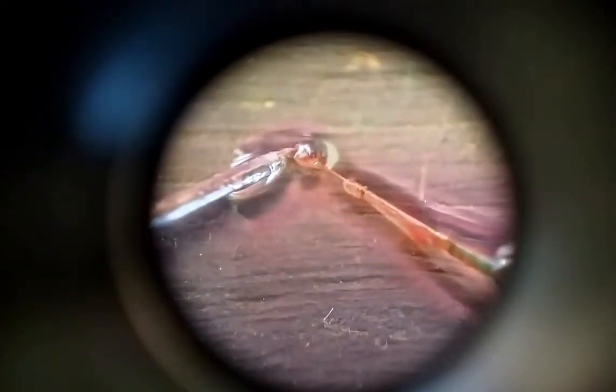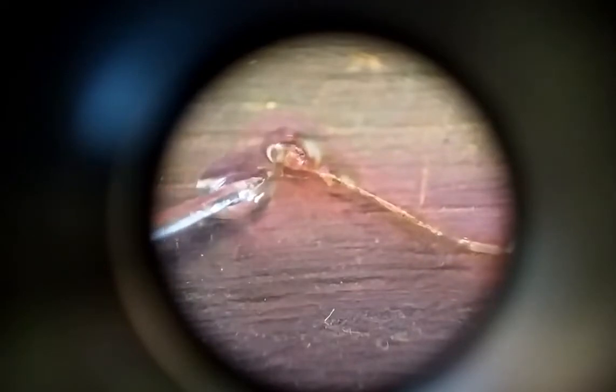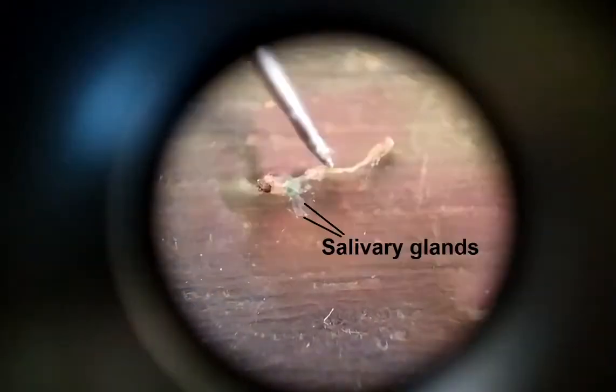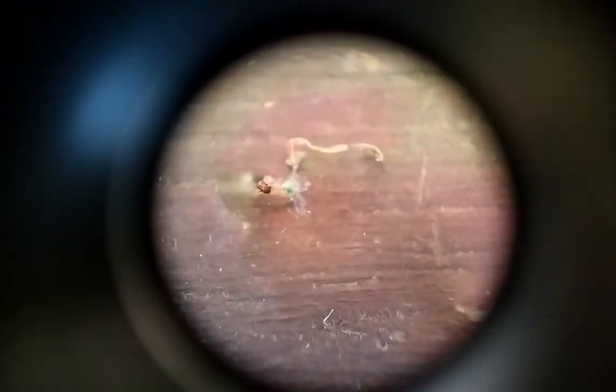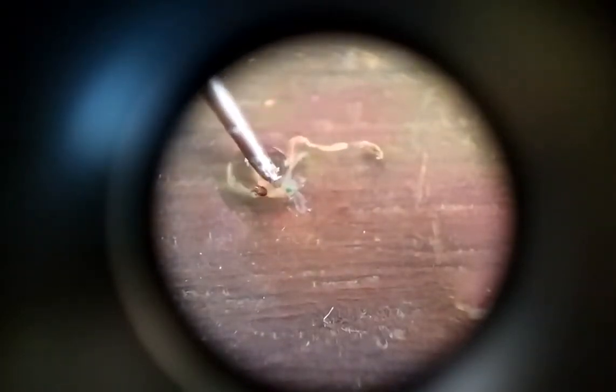With a little practice and patience, you will be able to pull off the head along with the gut and the pair of salivary glands, which are situated just beneath the head. The salivary glands are whitish, semi-transparent, and roughly oval structures about a millimeter or so in length and contain several cells.